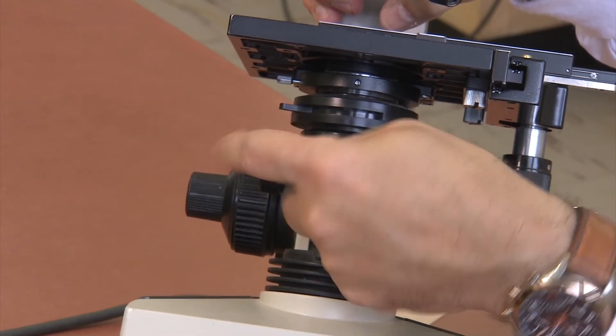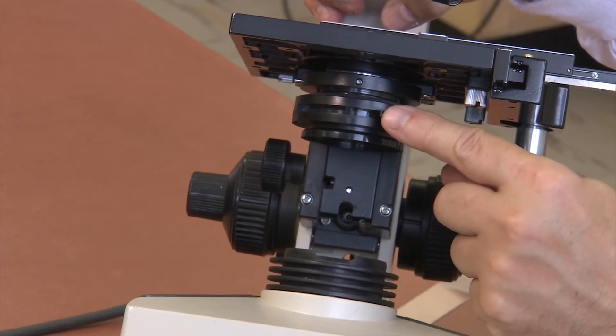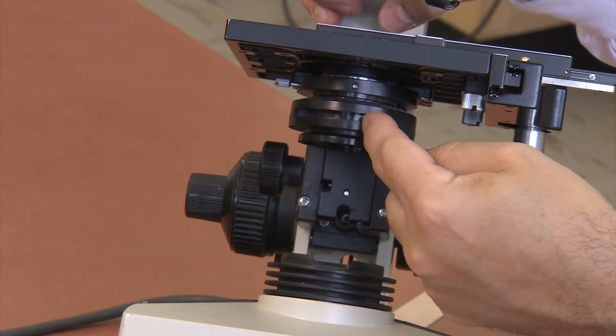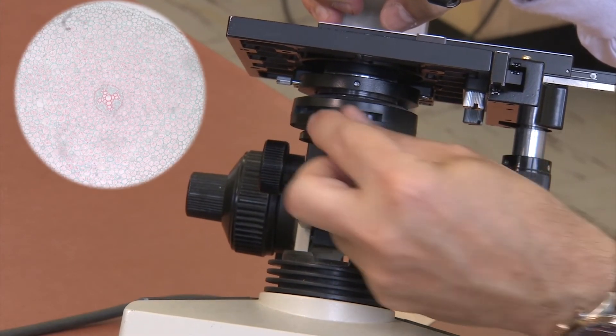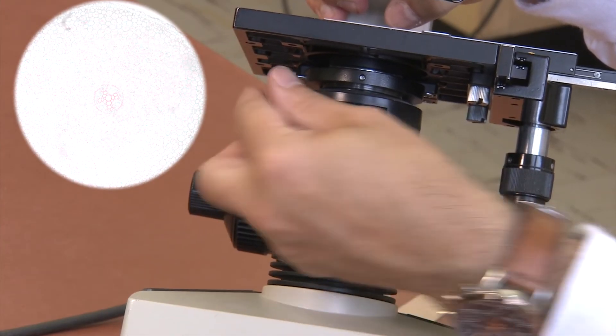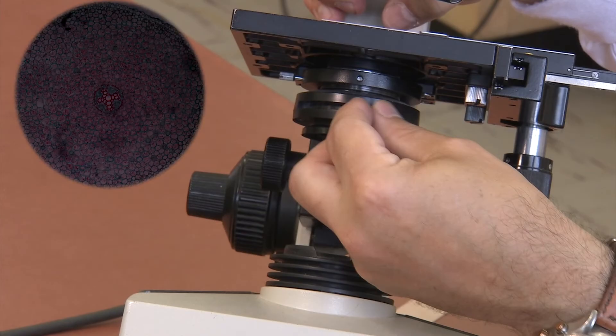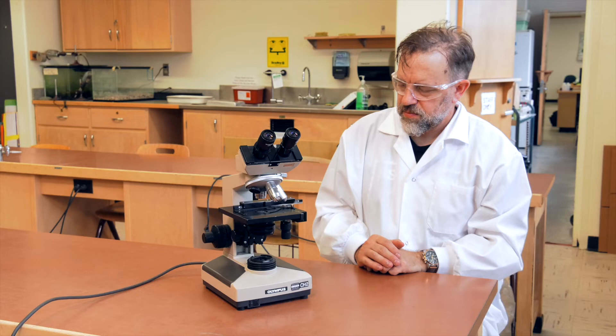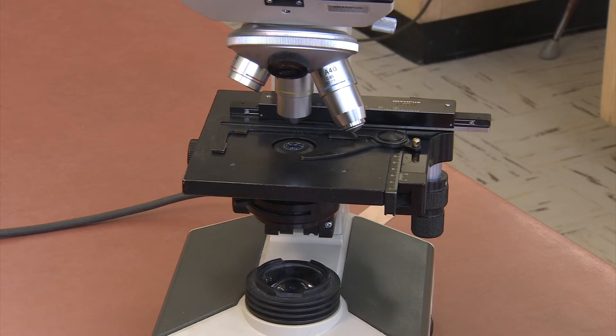The opening of the iris diaphragm is controlled by the iris diaphragm adjustment lever, which is located on the front of your assembly. Sliding the lever completely to the left fully opens the iris diaphragm. Sliding the lever to the right will close the iris diaphragm. These parts may differ between models of compound microscope, so be sure you can identify them or their equivalent on your microscope.